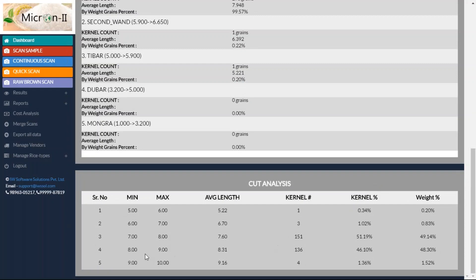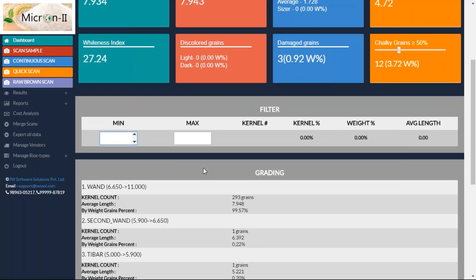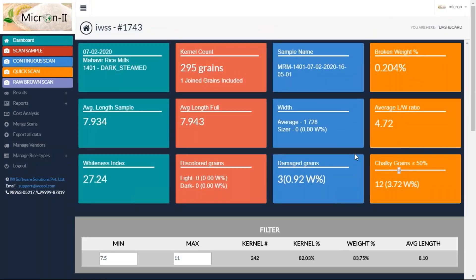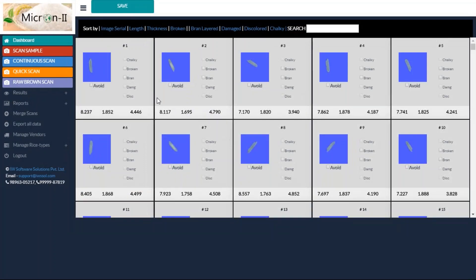Let's say I want results like how many grains are above 7.5 mm. I'll use the filtering system — I'll enter 7.5 to 11 mm. Now, 83.75 percent of the grains in this sample are above 7.5 mm length. This is the complete detail. We also have the facility to see individual rice with its characteristics — I can go to results, rice details, and get each and every individual grain listed there.